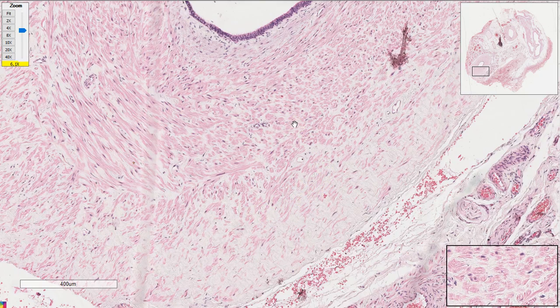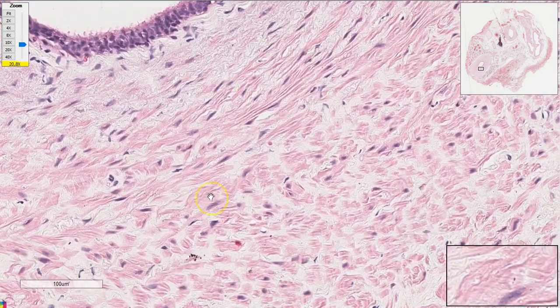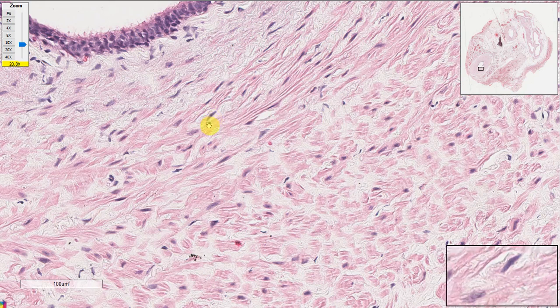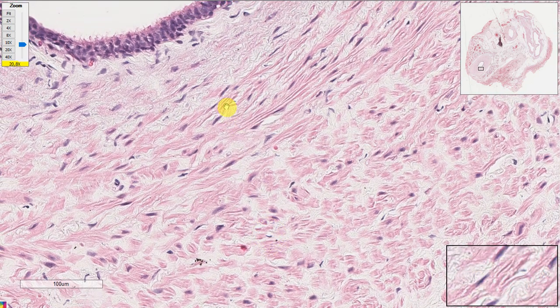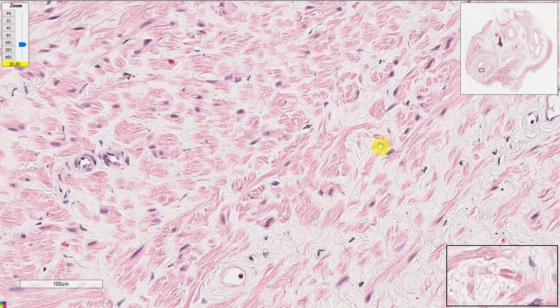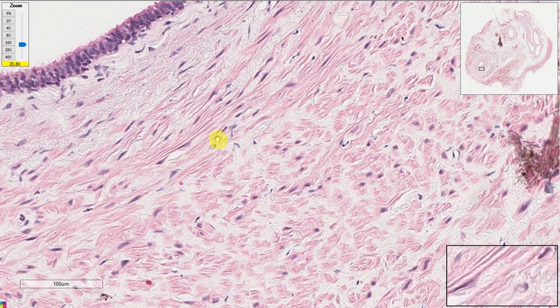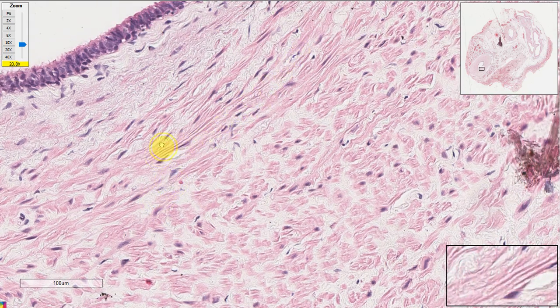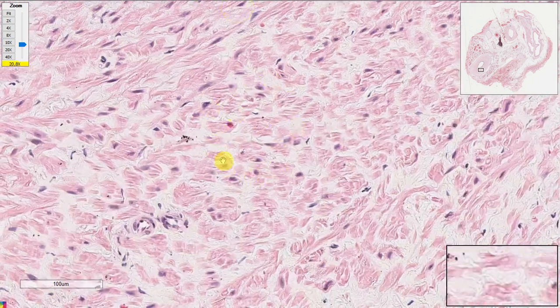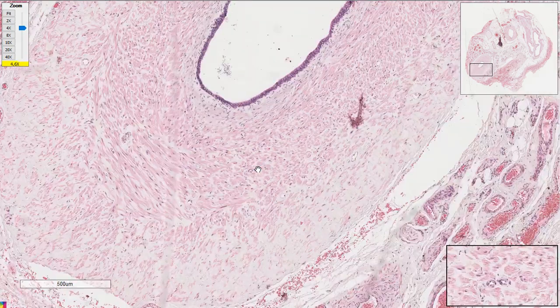As I'll keep mentioning, we know this is smooth muscle when you look at the nuclei, they have a cigar shaped appearance. So this is innermost, middle, outer: longitudinal, circular, and longitudinal. You can see how the muscle fibers move, and here, because of the cross section, the way it was sectioned, is why they appear circular on H&E sections.